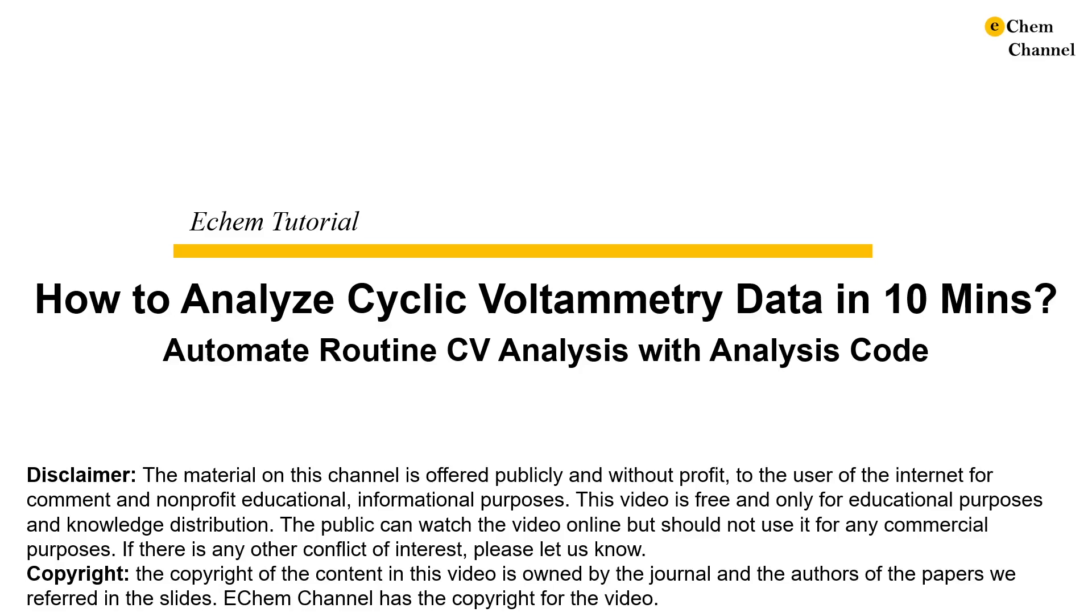Today we are going to do a demonstration of analyzing cyclic voltammetry data in under 10 minutes using analysis code. Hopefully it shows you how some routine analysis can be automated to save time. I will introduce the background and then perform the demonstration.